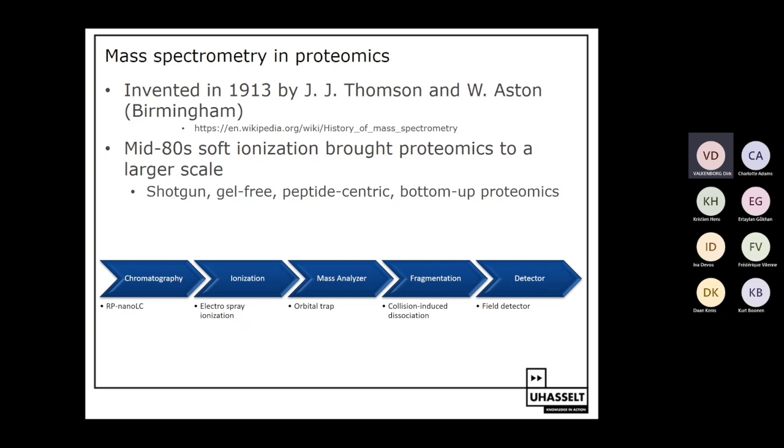And we will focus on a particular technological setup. There are different technological setups we could use to do shotgun or gel-free proteomics. I will only limit myself to one particular setup, and I can explain that here below. In a typical shotgun proteomics setup, we have a technological device called chromatography. I will explain that later.